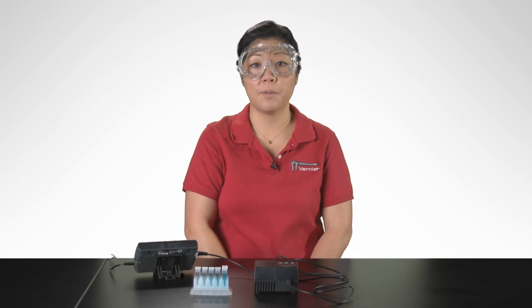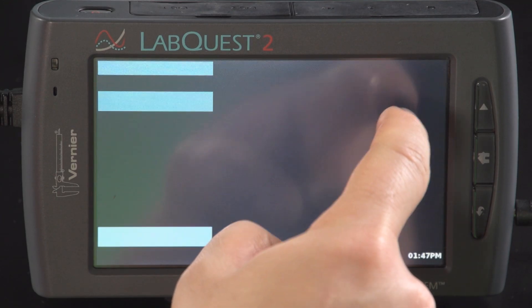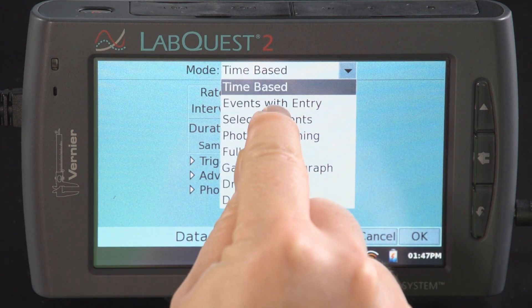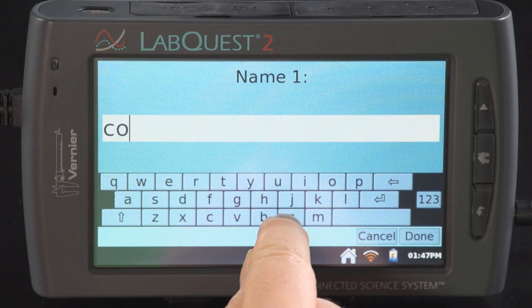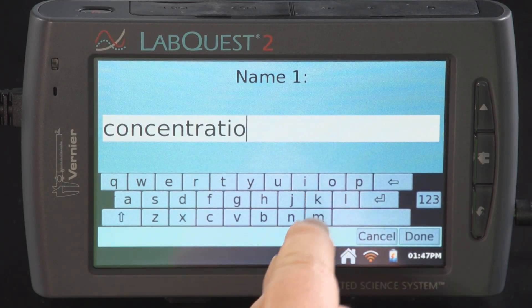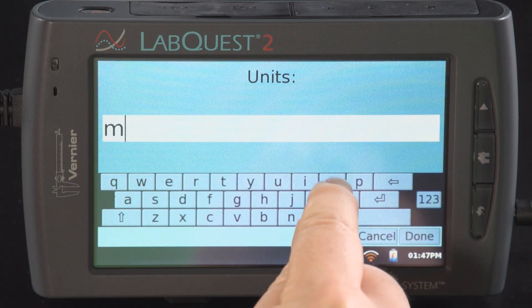For a Beer's Law Experiment, change the mode to events with entry, where the entry for this experiment is concentration. This will result in a graph of absorbance versus concentration.